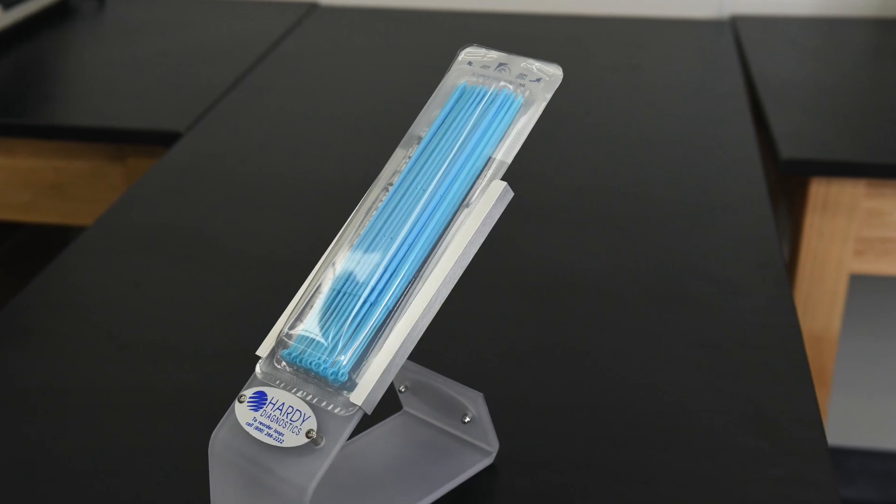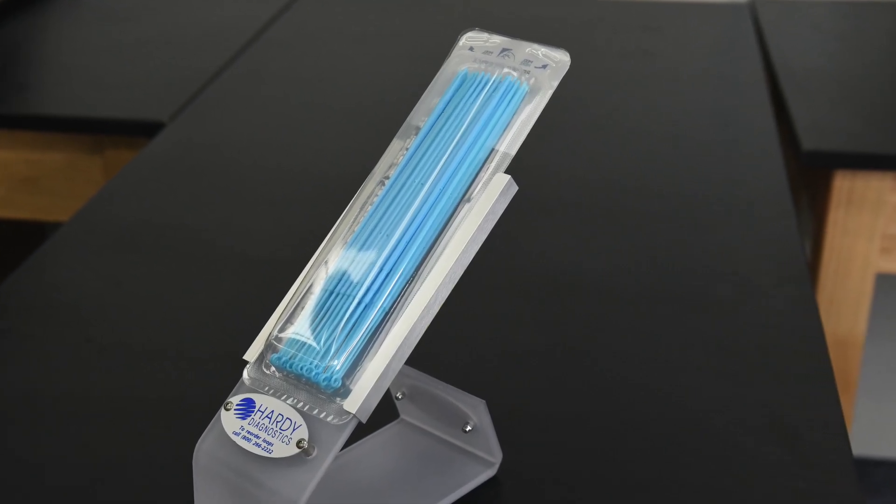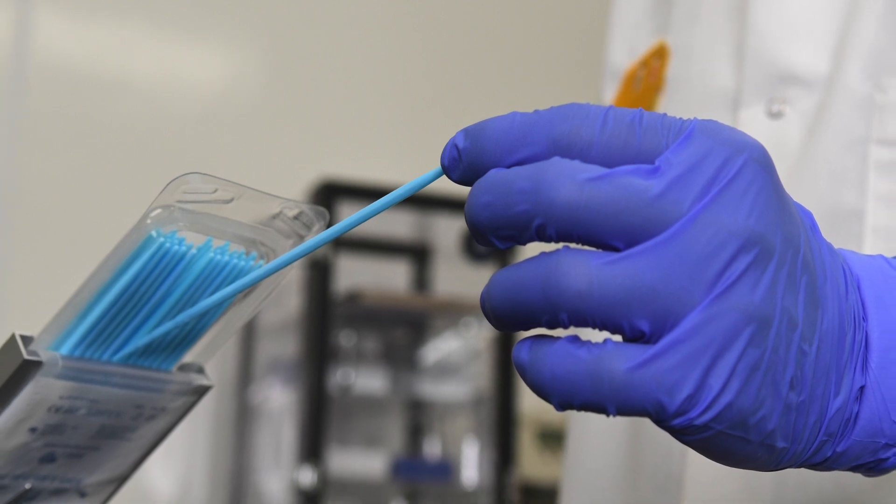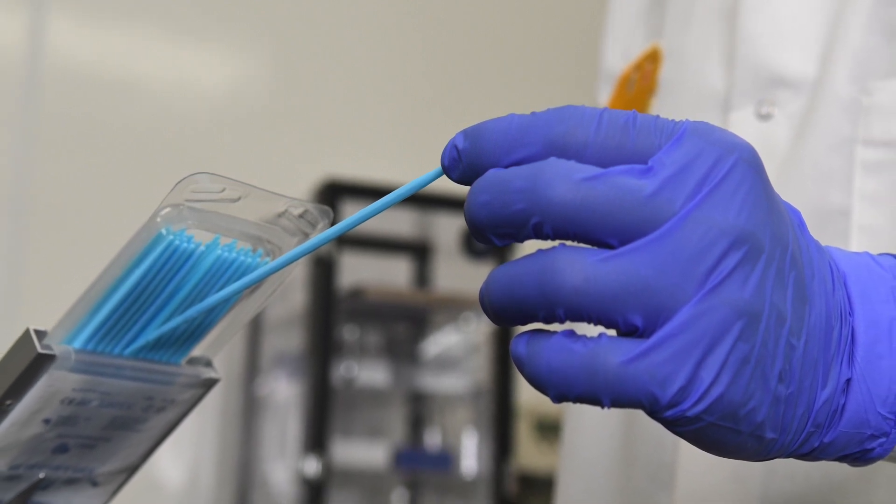The loop handles remain covered on top to reduce airborne contaminants. The Loop Caddy eliminates the laborious task of opening and closing loop containers each time a loop is needed.